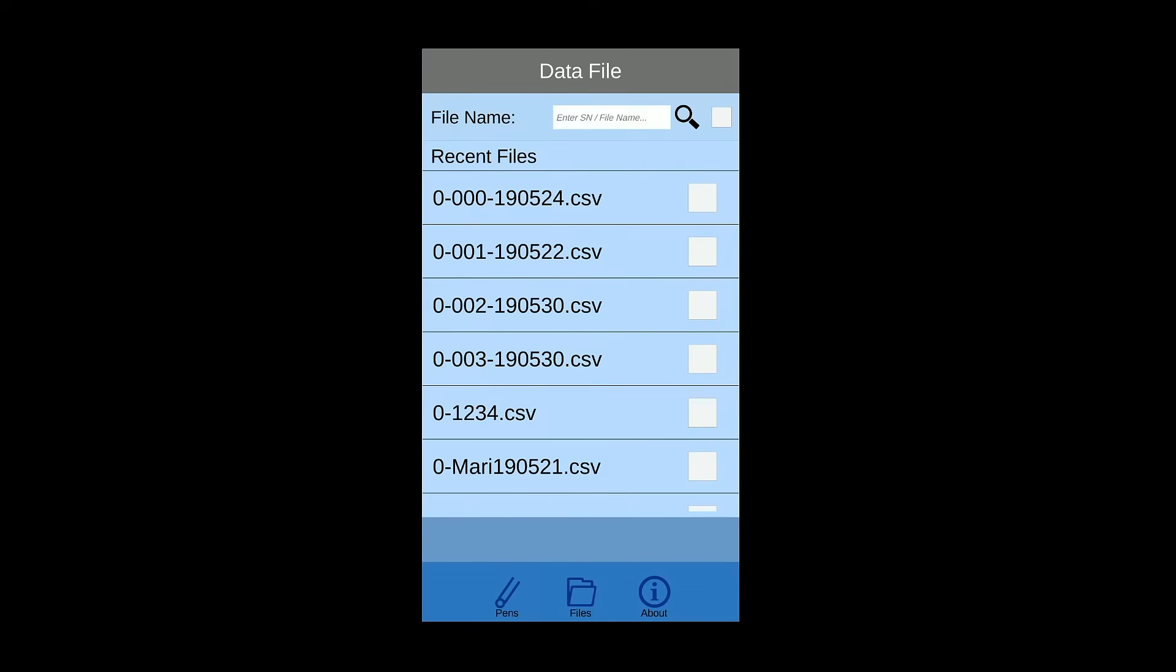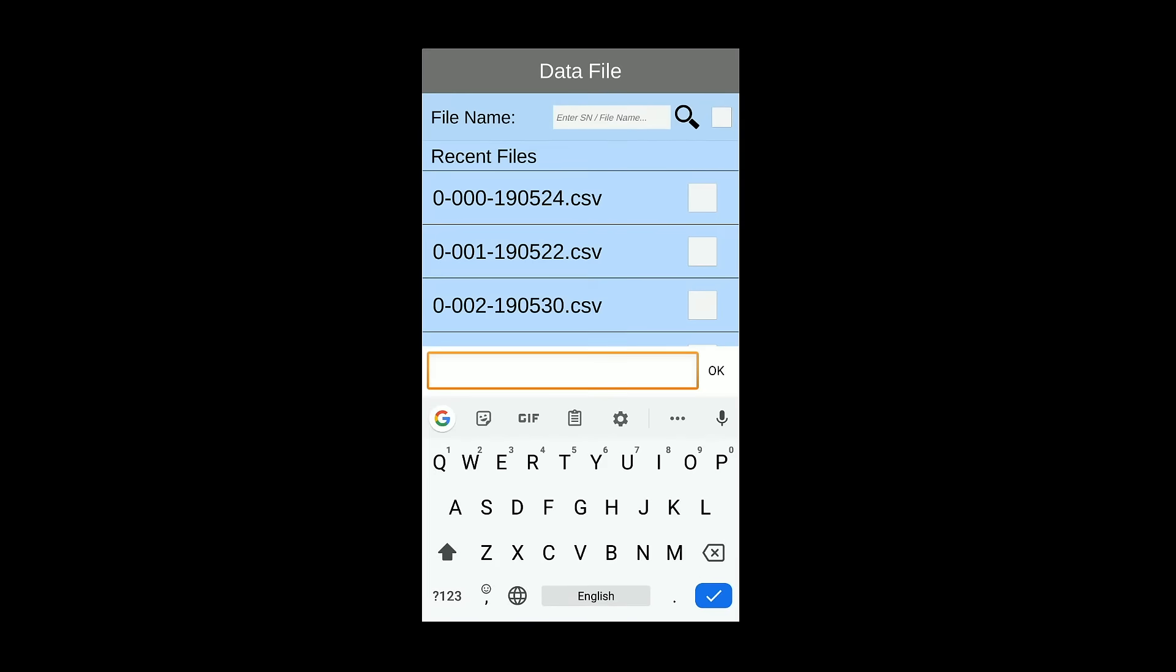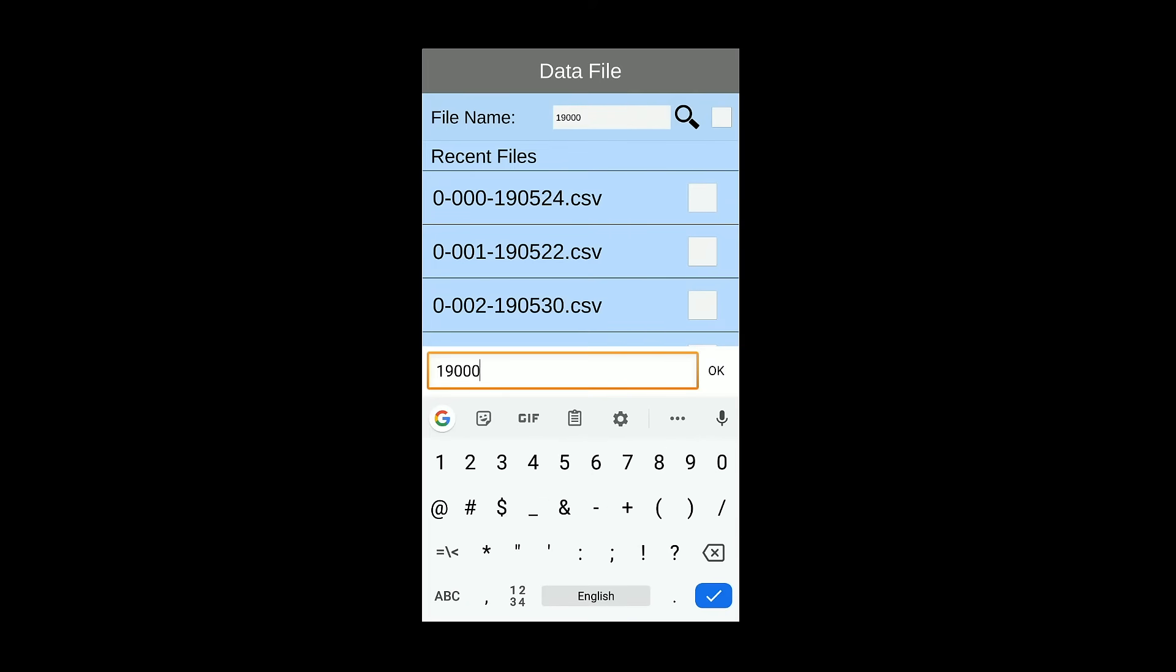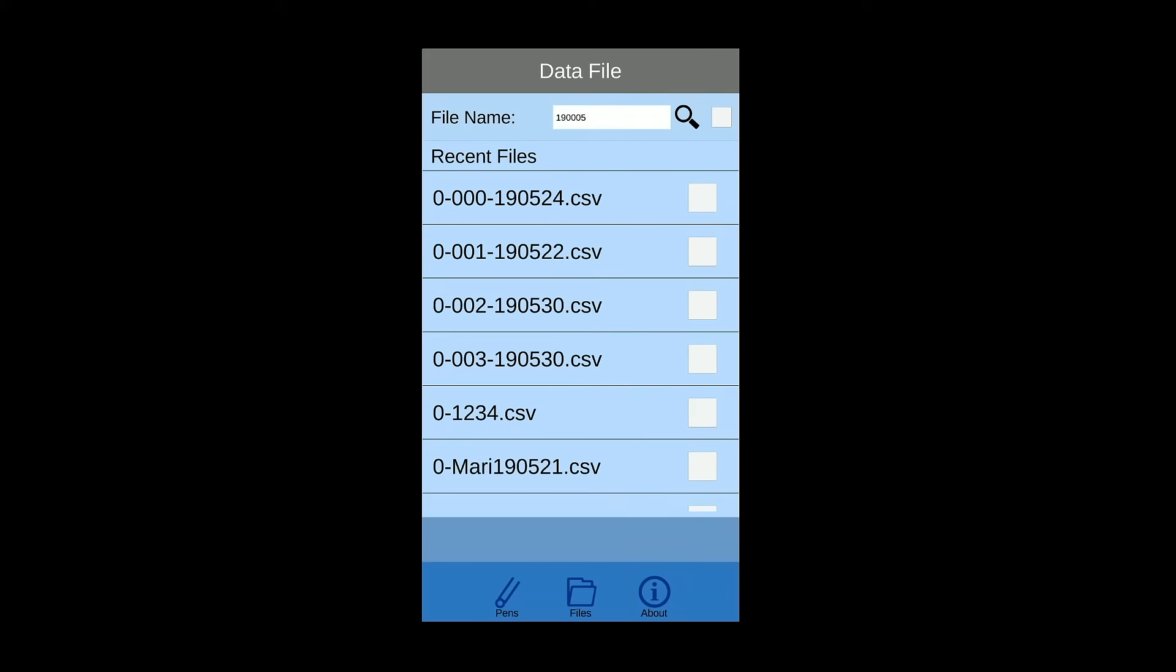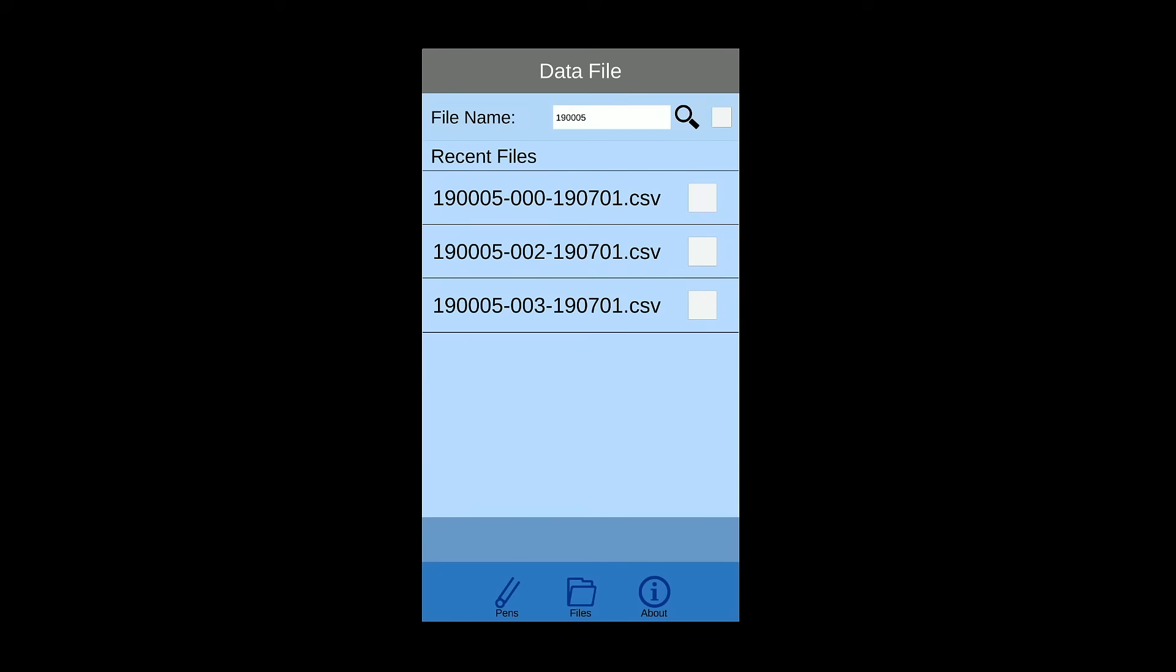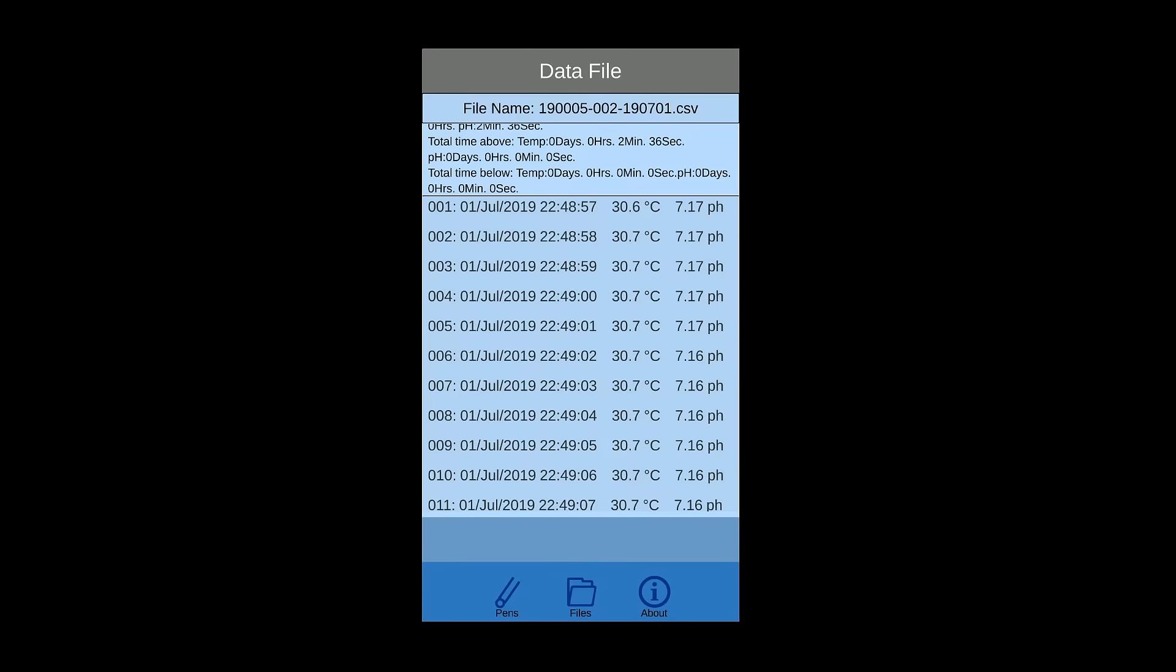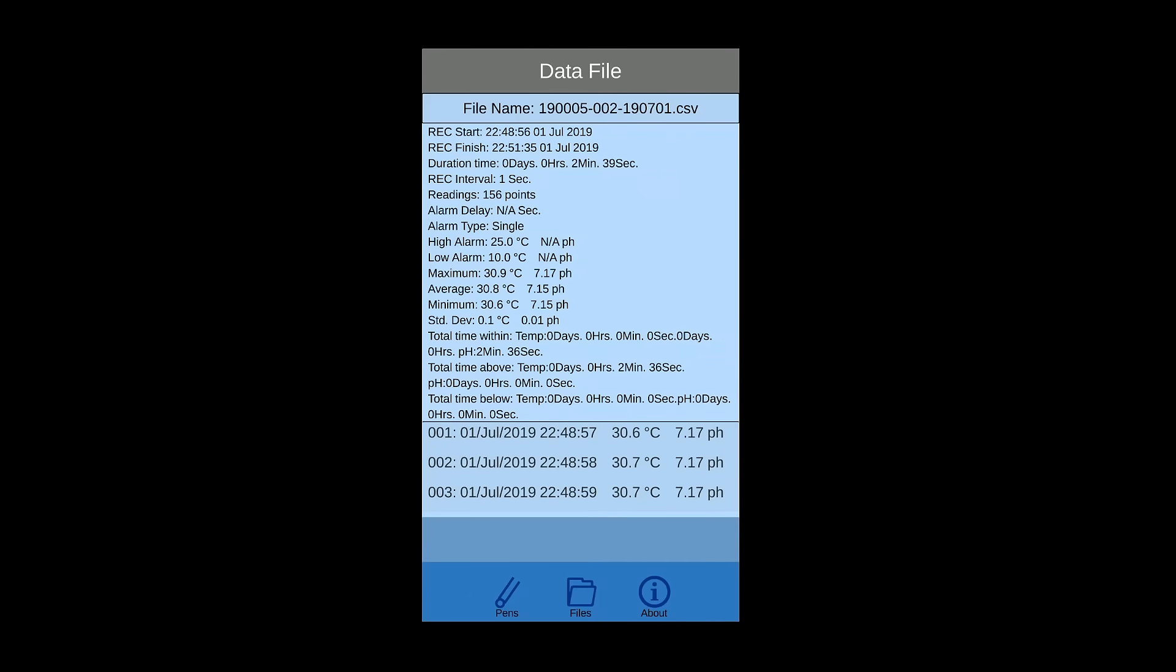Press file button to search for history data. Searching by using serial number or keyword which you edit as file name. Click file name to view detail information.